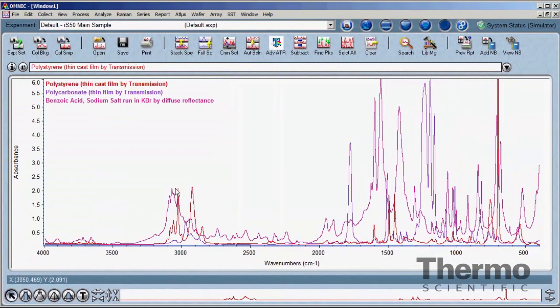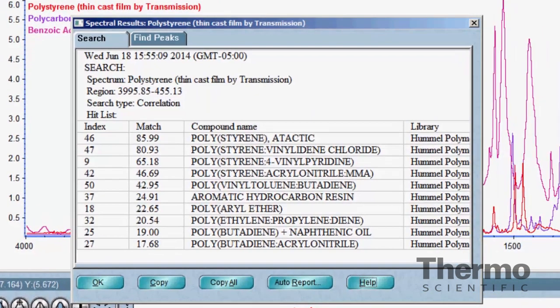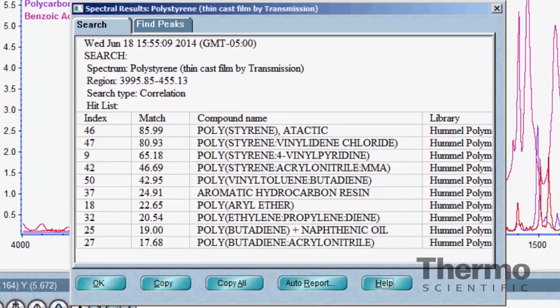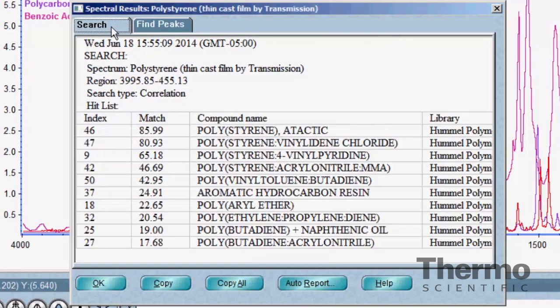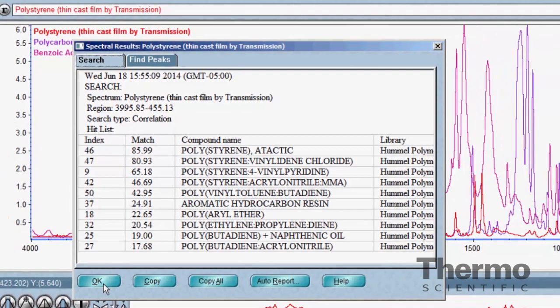The R button opens the spectral results screen. Any process applied to the spectrum that extracts information will add the information to this display. Find peaks and spectral search results are examples of the type of information recorded here.